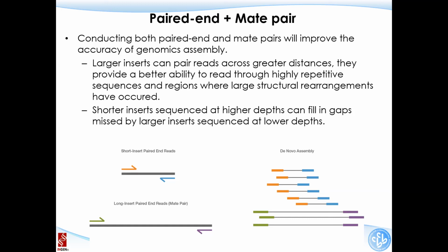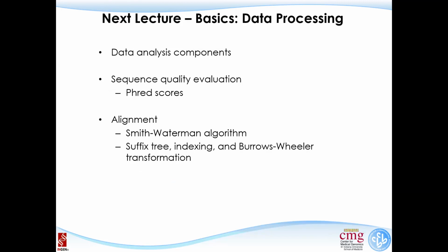So that is what I need you to know about mate pair and paired end. The size of the DNA fragment is different, the directionality is different, and I want you to know how mate pair sequencing is achieved. I think that's fair. Okay, so we're done.